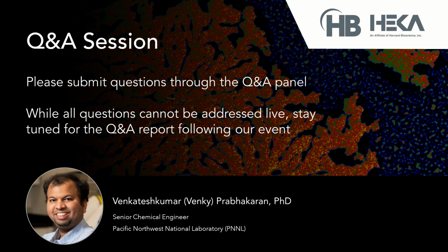Yeah, I will stop there. Perfect. Great answer. Okay, can it be implemented inside a vacuum chamber for electron microscopy, for example, with liquid electrolyte with low vapor pressure?